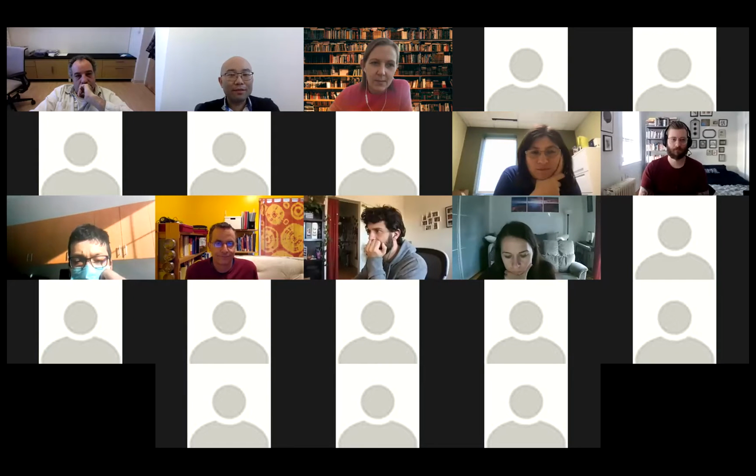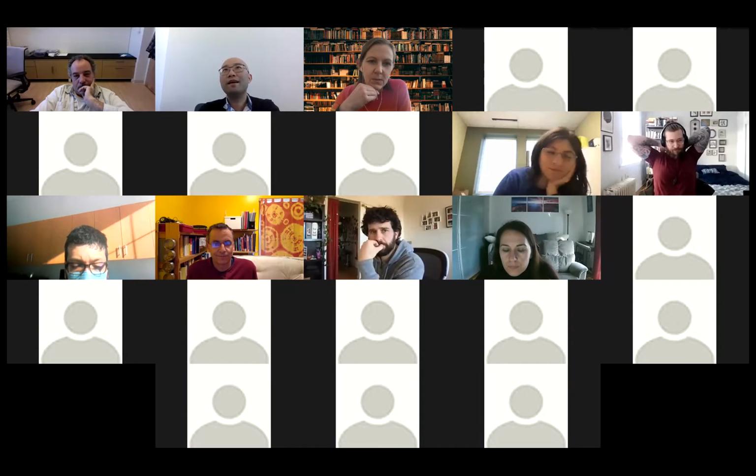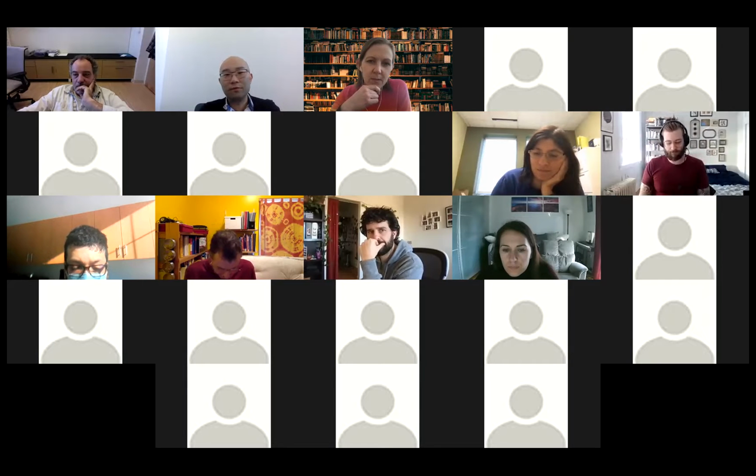A question I want to pose to everyone here, and you can type your answer into chat. If you had to solve a reconstruction, what would your resolution range goal be? Because I remember talking to Tom one time, and he had wonderful data in stain, but the reviewer said, well, it's not in cryo, so I don't believe it. And then now I think the question becomes, at what resolution? And we might have to keep on pushing. So if you can type in chat, if I gave you a cryo-EM paper, what resolution range or max would you feel comfortable in believing any claim, or do you have any preconceived notion?